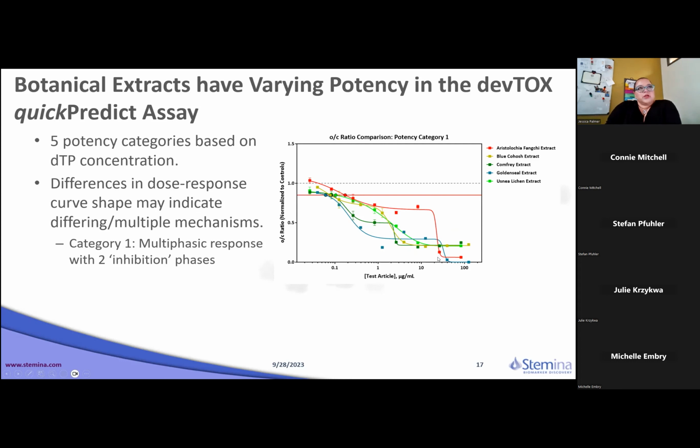Part of that would be caused by an initial response in the cystine, followed by a more striking effect in the cystine when a compound becomes cytotoxic. But as I had mentioned, only 2 of these were actually cytotoxic in the cells. So it could also be that after a certain concentration is reached, there are multiple mechanisms impacting how the cells take up that cystine from the media.